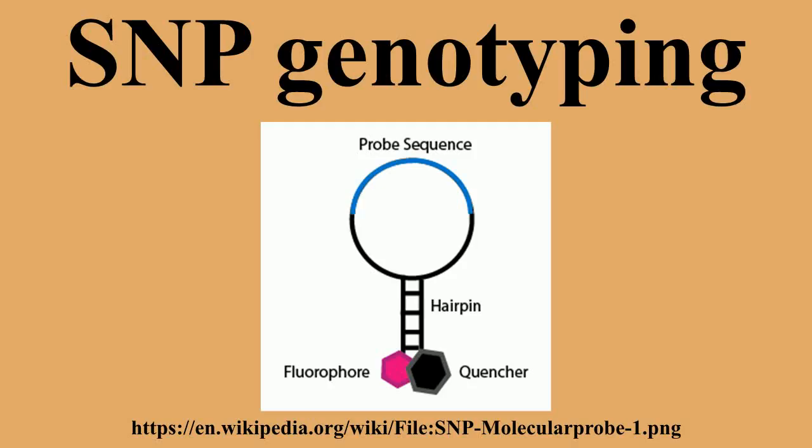Probes are designed to have the SNP site in several different locations, as well as containing mismatches to the SNP allele. By comparing the differential amount of hybridization of the target DNA to each of these redundant probes, it is possible to determine specific homozygous and heterozygous alleles.